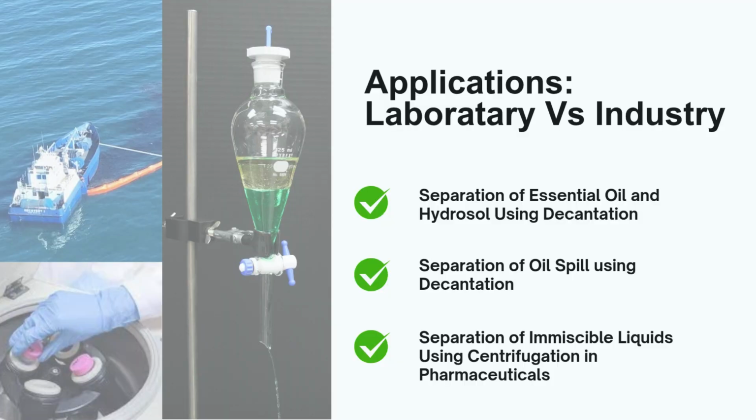For the applications between laboratory versus industry, there will be 3 main focuses that we will be discussing today. The first one is separation of essential oil and hydrosol using decantation. Next, separation of oil spill using decantation. And the last one is separation of immiscible liquids using centrifugation in pharmaceuticals.